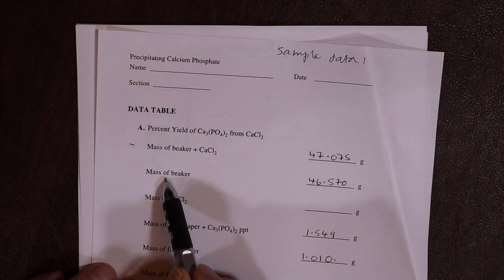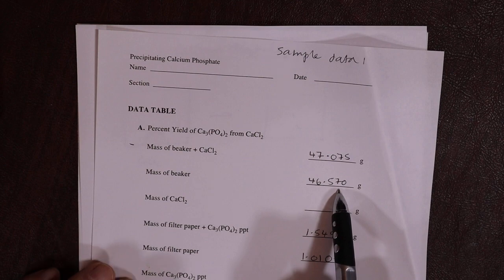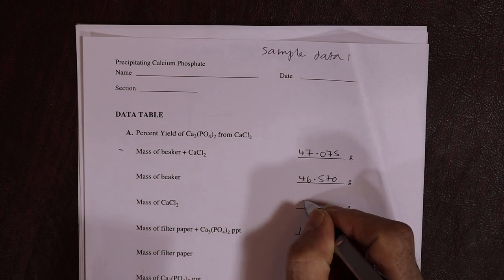So you weigh an empty beaker, you weigh the beaker and the calcium chloride. This is pretending the numbers you got. Now your numbers for your sample data set will be different. Okay, I'll work out mine just to try and show you how to do it. So obviously the mass of the beaker and calcium chloride minus the beaker alone. So that's 47.075 minus 46.570 is 0.505. All right.